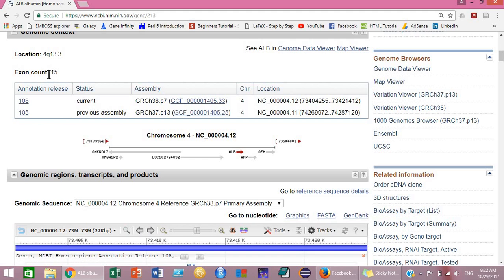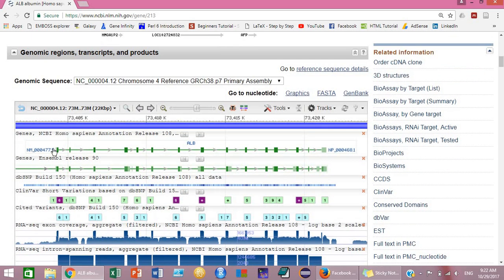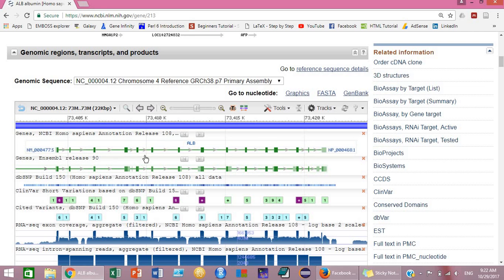Here you can see the number of exons in this gene. There are 15 in number. This is the graphical view of your gene, human albumin gene, and these are the exons shown in green blocks.